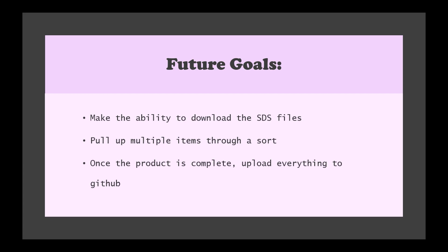Some future goals. With the time constraints of this project, I was not able to make the SDS files downloadable. I also was not able to pull up multiple files or items through a sort. And finally, one day when my project is fully complete, I hope to upload everything to GitHub so that it can be on a server and people can access my website from anywhere.